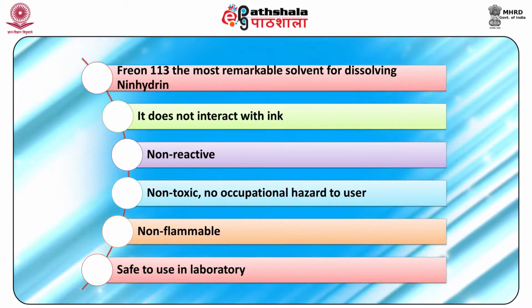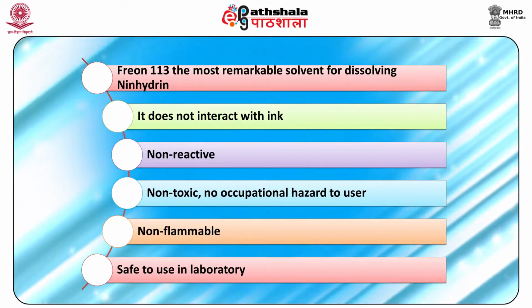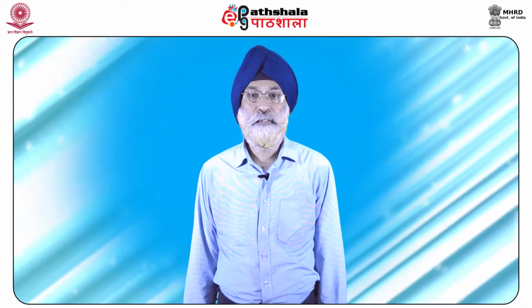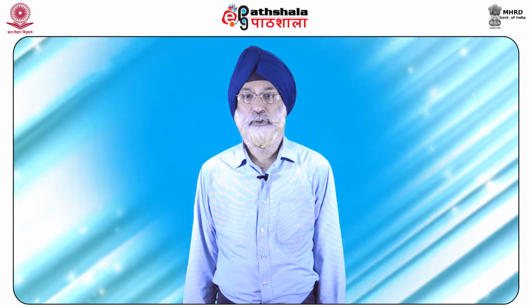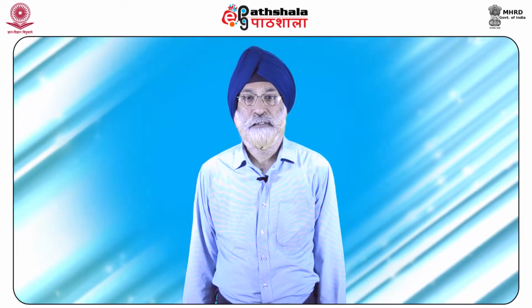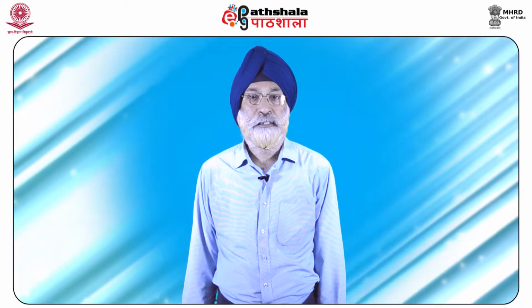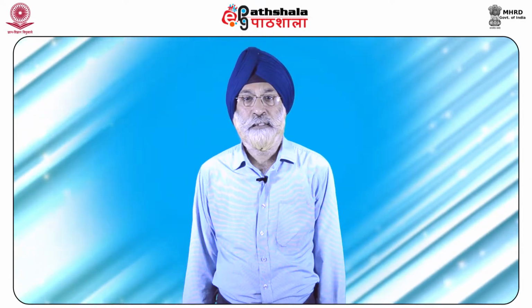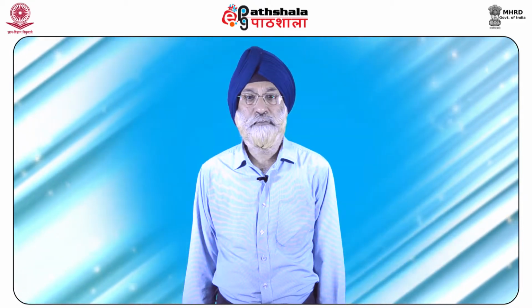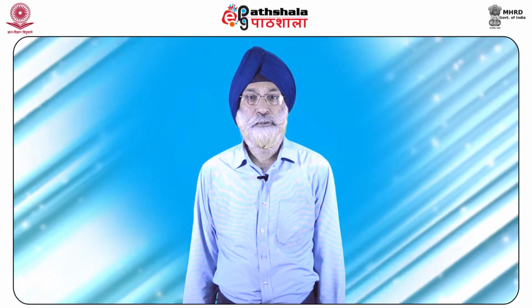As a result of these characteristics, the Ninhydrin based composition has come to be referred to as non-inflammable Ninhydrin, or NFN. The NFN develops fingerprints on a wide range of paper items. It provides a minimal amount of background effect. Moreover, it is effective on surface coated papers such as currency notes as well as the gummed side of postal stamps. It is however being feared that it may not be possible to continue with NFN in the years to come.